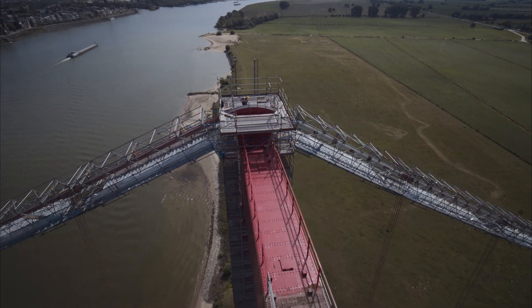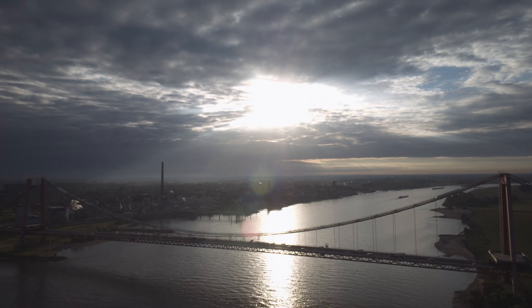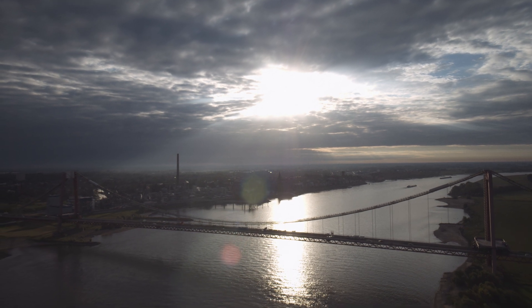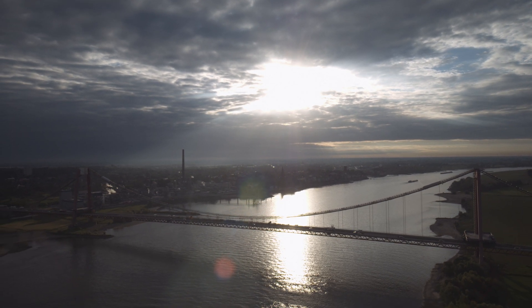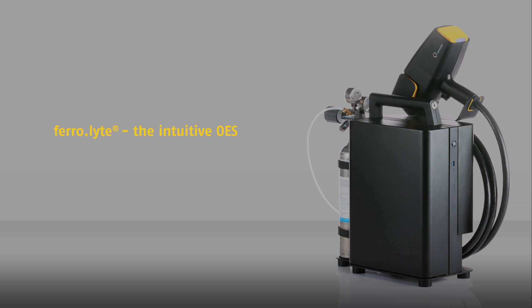For precise and intuitive metal testing. Whether in the factory or at the highest altitudes. Ferrolite.